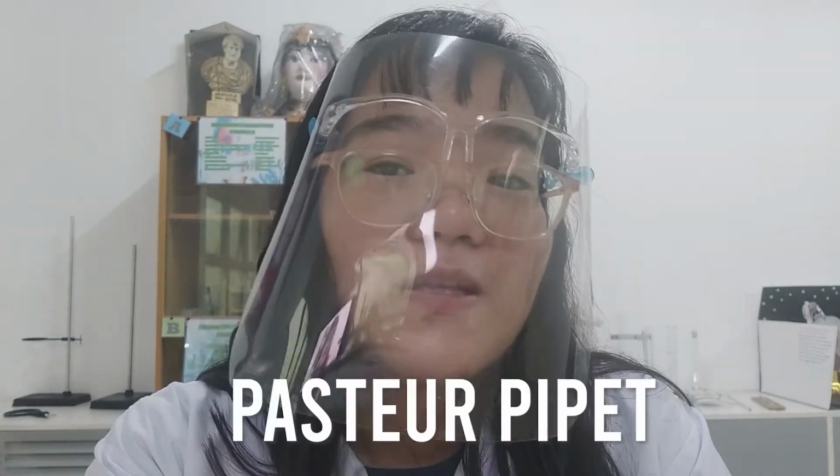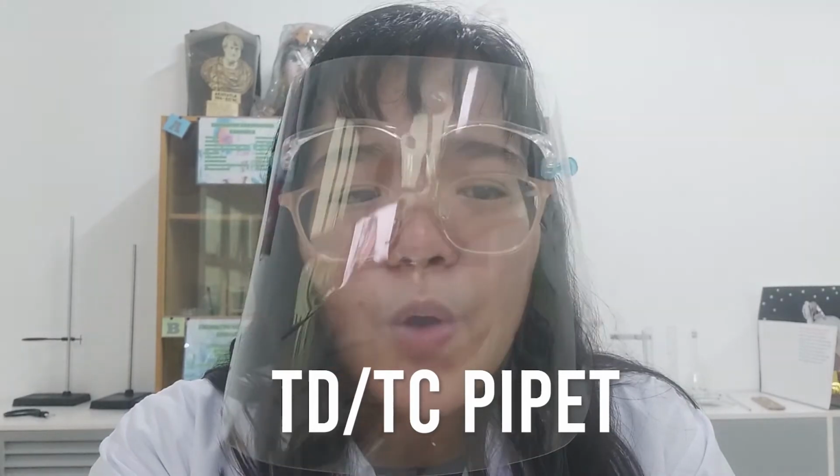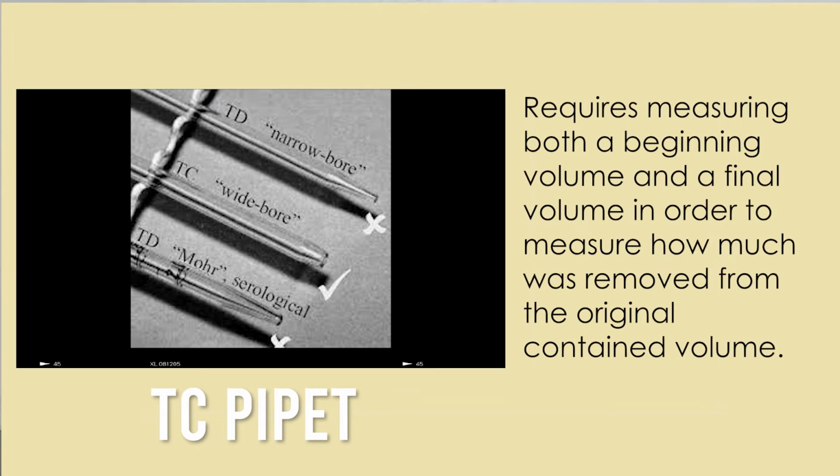The third is the Pasteur pipette, which is used for very small but not specific volumes. And lastly, TD versus TC. TD, which means to deliver, glassware measures the exact amount from the line after allowing the contents to pour naturally out of the tip using gravity. TC, which means to contain, glassware requires measuring both a beginning volume and a final volume in order to determine how much was removed from the original contained volume.